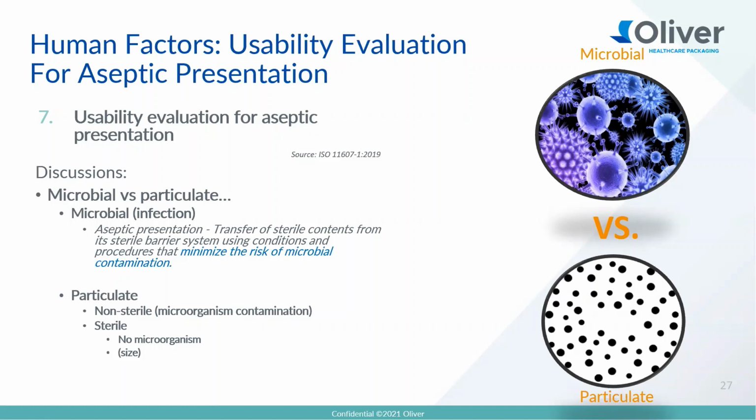So Jeff, just so I'm clear, when you talk about sterile particulate, it really comes down to the size of the particulate that's found, and would I be right in saying it becomes a type of judgment call, or is there a limit? There is, but it's really based on the application where it's being introduced into the body. Okay, it depends. Yeah, I get you.